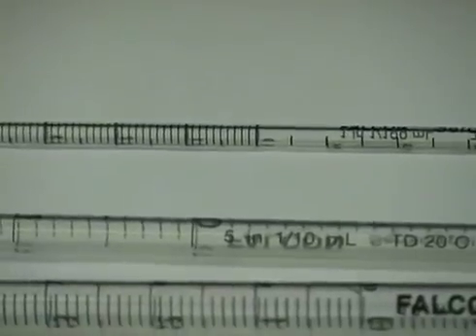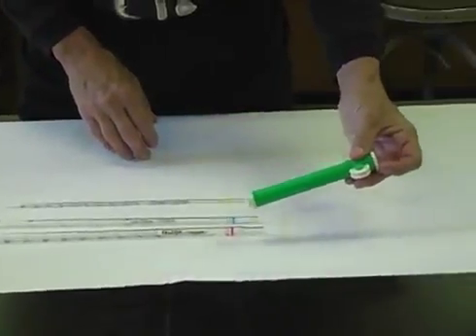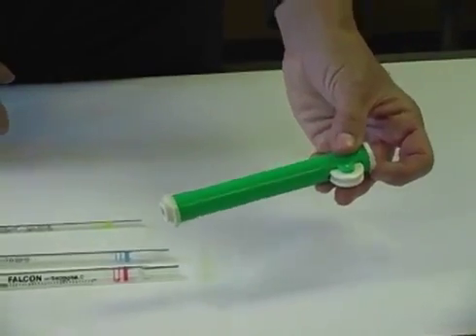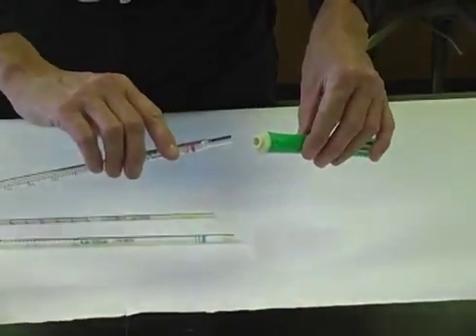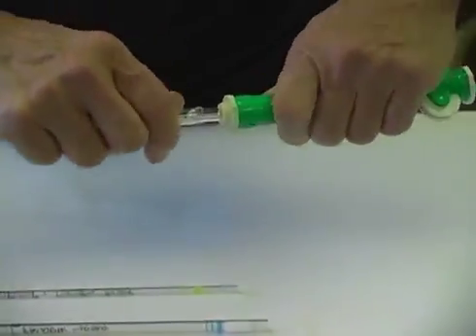It's important that we never mouth pipette. Instead, we'll use pipette pumps. The larger pipettes, the 10 ml and the 5 ml, will use the green pipette pumps. We'll place the blunt end of our serological pipette into the hole with a gentle twisting motion, applying a little bit of pressure.